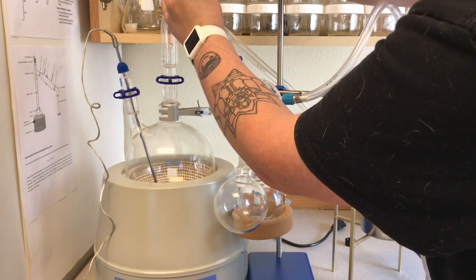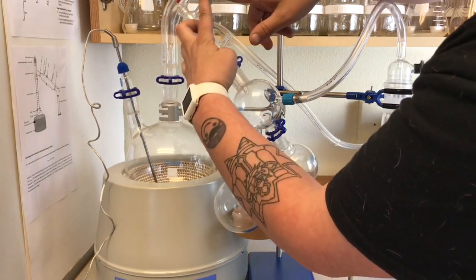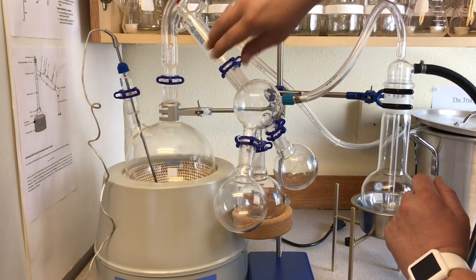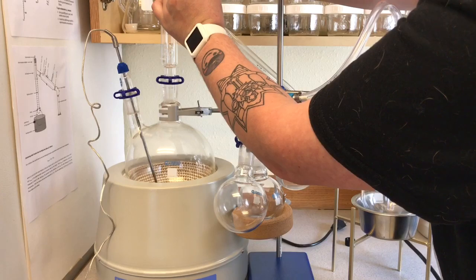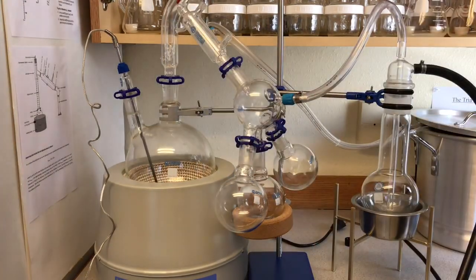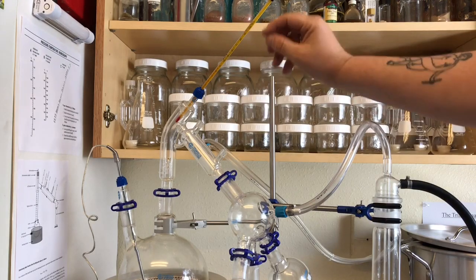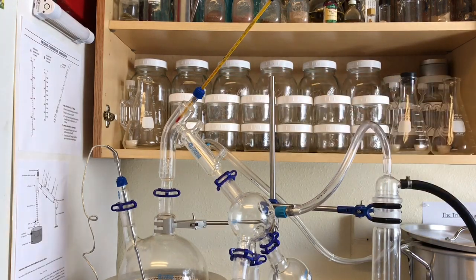We want the tip of our thermometer to be right here, right where the two pieces come together, and we're going to be recording the temperature right there, so that's the reason why we're using the long thermometer. We want it to be exactly where these two pieces of glass meet, and we want to make sure it's nice and snug on here so that we can get a good vacuum seal. This illustrates a little better what I'm saying, and you want to make sure it's where you can read it. Also, as you put this in and out, you want to do it from here and not from back here so that you don't accidentally break your thermometer.